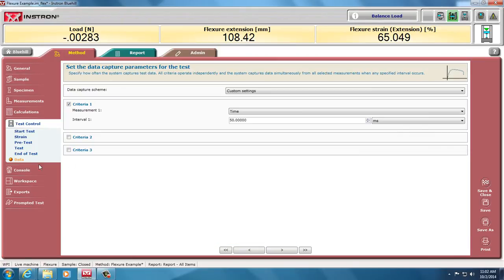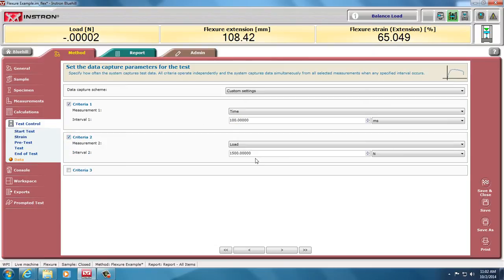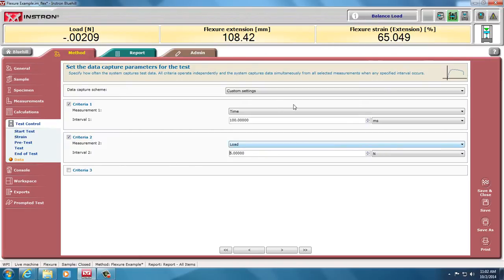We have to choose how we take our data. This default here is at 50 milliseconds. We could change that to whatever number we want. We can also add other criteria, such as every 150 newtons or every 5 newtons we could take extra data. That's in case we want to make sure we absolutely catch the peak load.